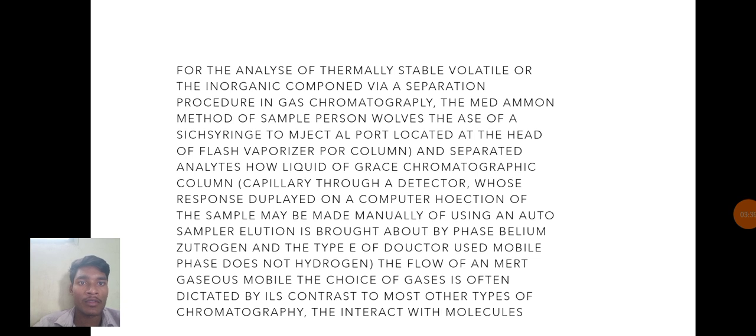Injection of the sample may be made manually or using an autosampler.